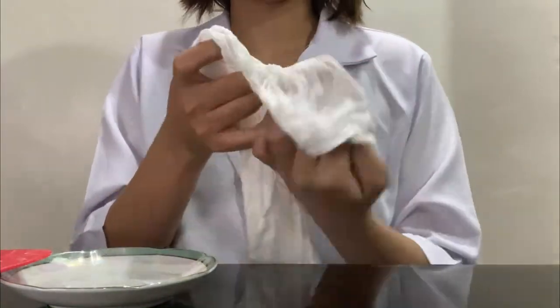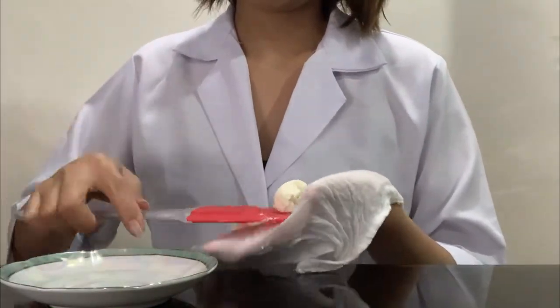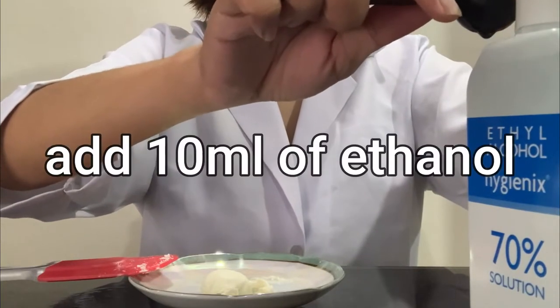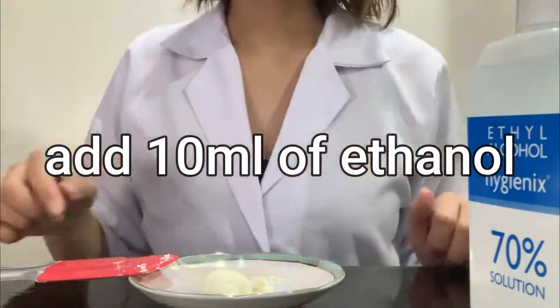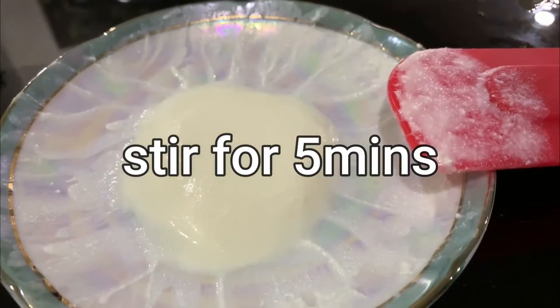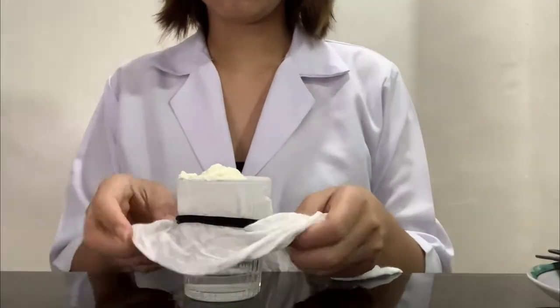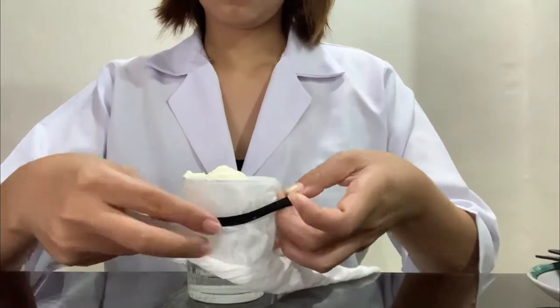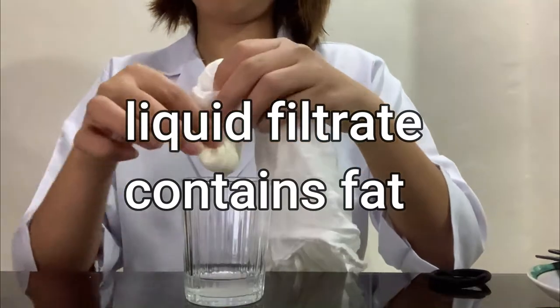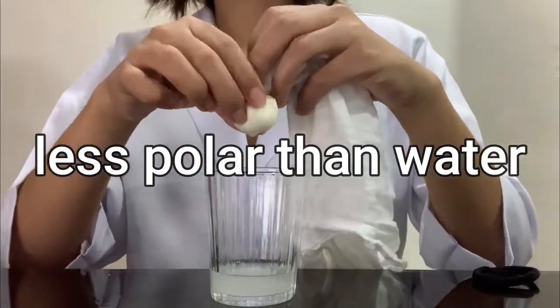Using a spatula, scrape the precipitate from the cheesecloth into a clean container, then add 10 ml of ethanol to the beaker. After stirring the mixture for five minutes, filter it again using cheesecloth, squeezing the cloth gently to remove excess ethanol. The liquid filtrate contains fats and must be discarded.